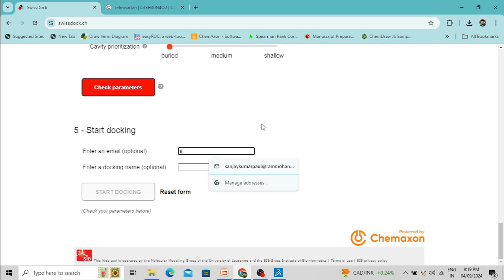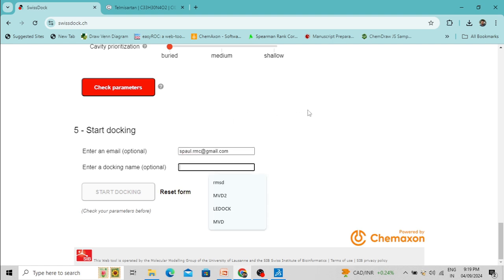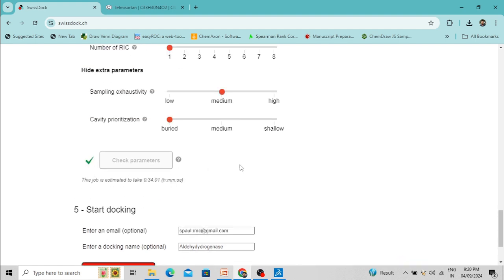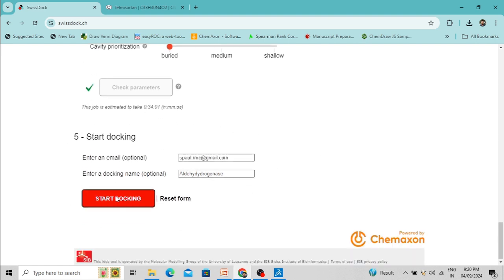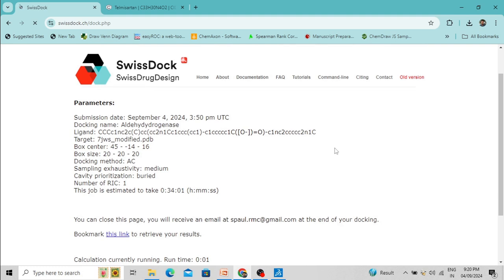For docking you need to enter your email ID. I am entering my email ID here. You can also enter a docking name — I am writing 'Aldehydydrogenase'. A green checkmark has appeared, confirming all parameters are correct. Now click here to start the docking. It will take some time — the approximate time is 34 minutes. After docking is finished, the result will be emailed to the provided email ID, and there is also a link you can click to get your result.